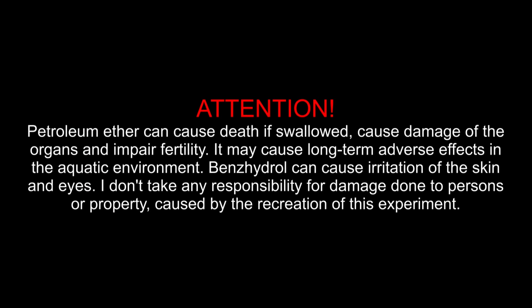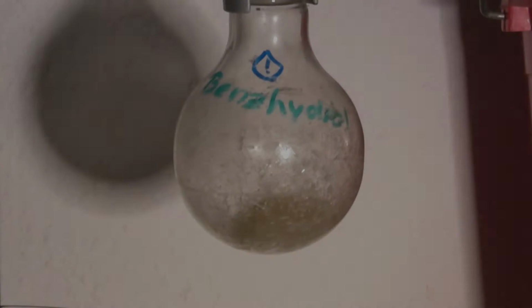Attention! Petroleum ether can cause death if swallowed, cause damage of the organs, and impair fertility. It may cause long-term adverse effects in the aquatic environment. Benzhydrol can cause irritation of the skin and eyes. I don't take any responsibility for damage done to persons or property caused by the recreation of this experiment.